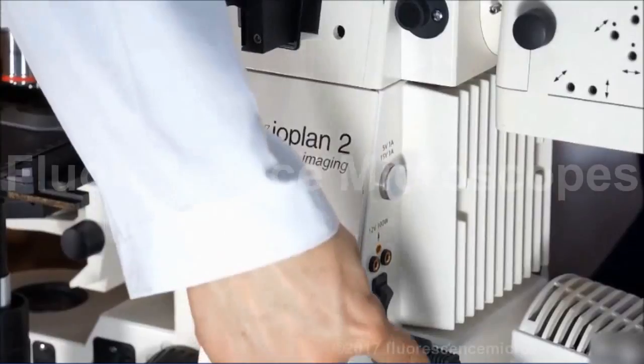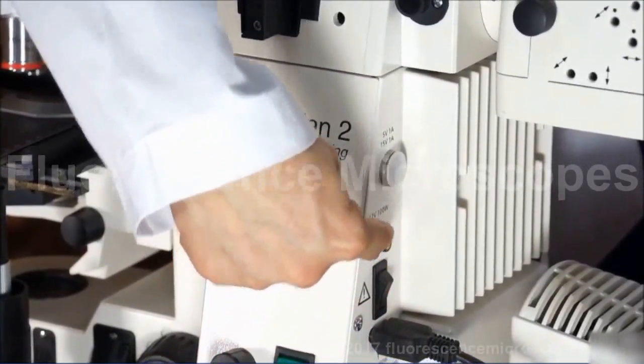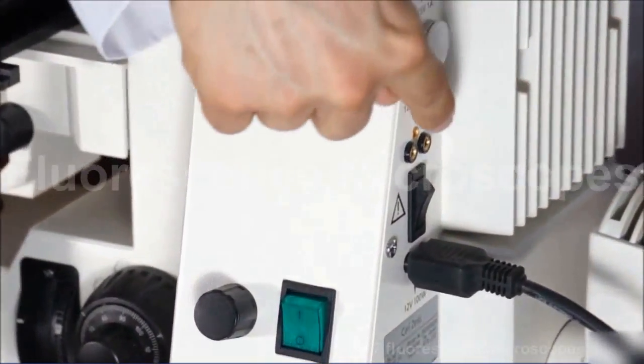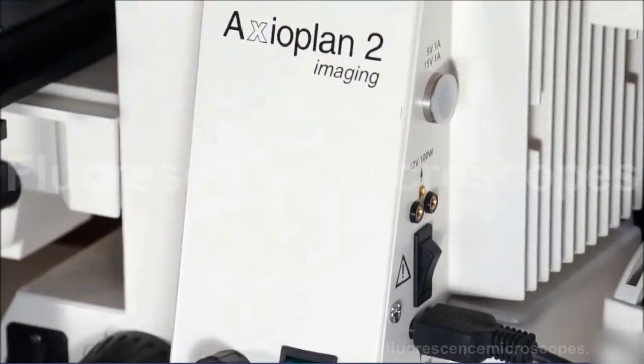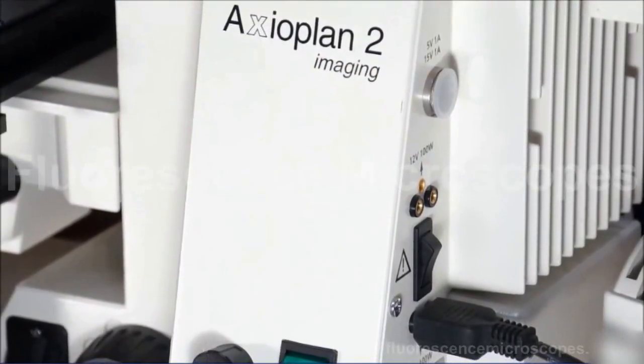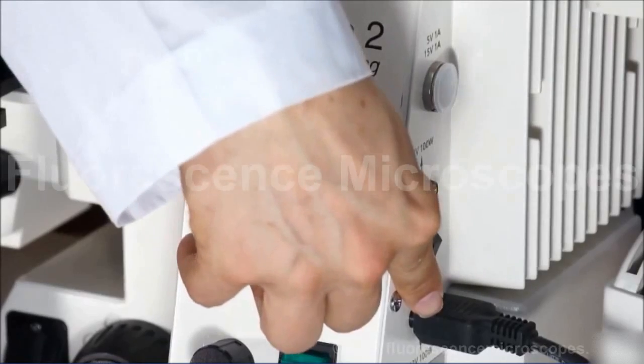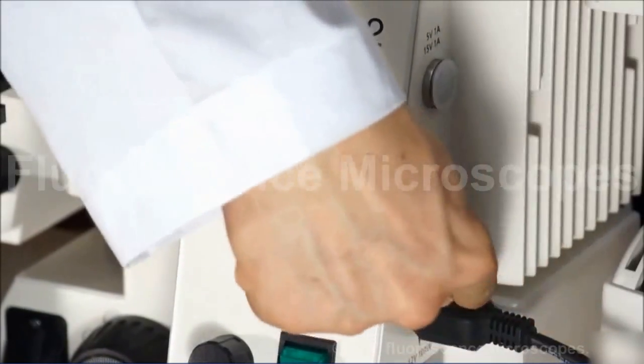You've got two different ports for your halogen. This is if you were to have a halogen at the top. We're not using a halogen at the top because we're not configuring it for metallurgical. It's configured for fluorescence, so we're only using the bottom halogen.